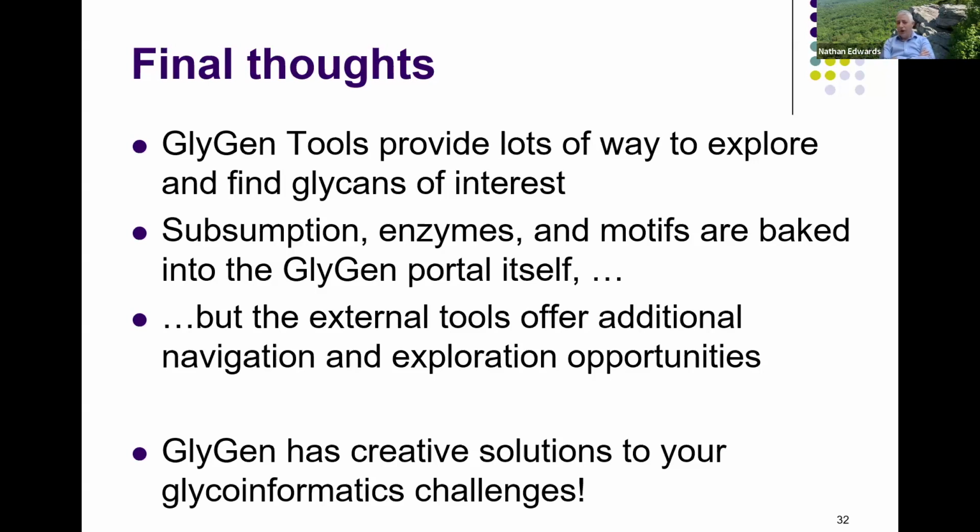We have lots of creative solutions to your glycoinformatic challenges, and we'd love to hear about your challenges so that we can help you solve your glycoinformatics problems. We may not be able to do them directly within the GlyGen framework. Sometimes it will take external tools, but often we have already confronted problems such as the ones you're hitting, and we've got strategies for trying to solve them.